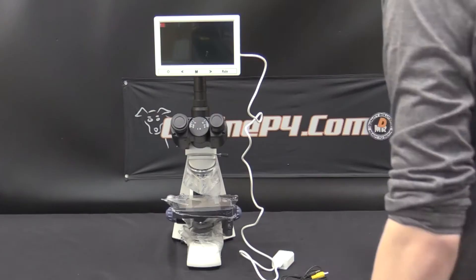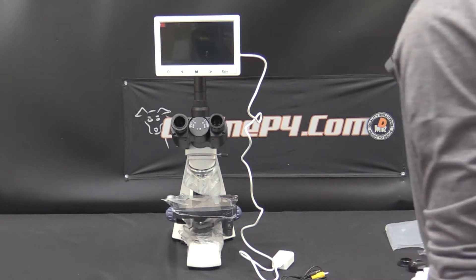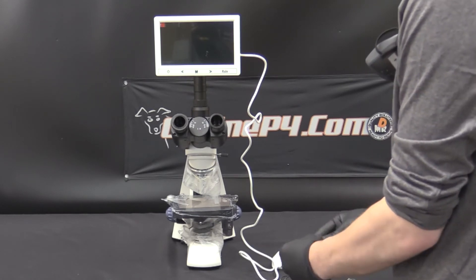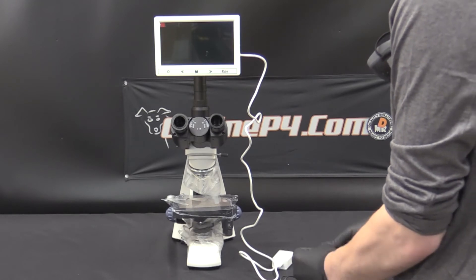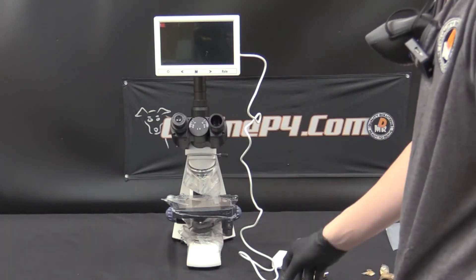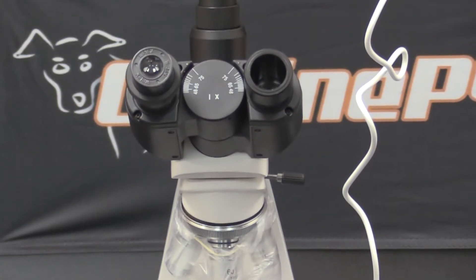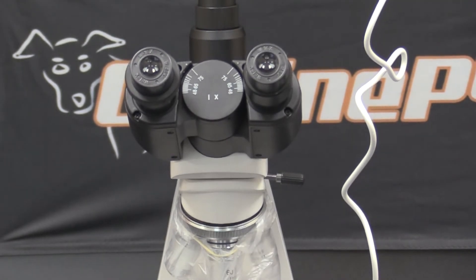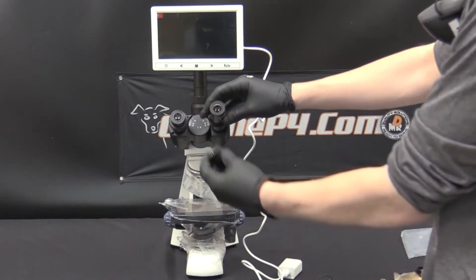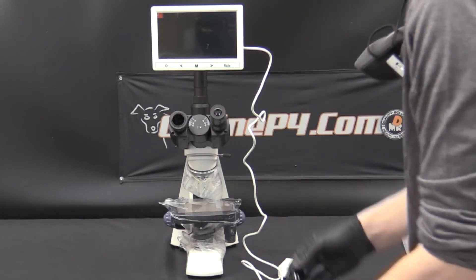The next step is to remove the caps for the ocular lens eyepieces. You will have to install the eyepieces and you have two different sets to choose from. The first set is a magnification of 16x — these just slide in and are ready to be viewed through. The other longer set is the 10x magnification, so using the smaller eyepiece actually gets you more magnification than the longer one. We will demo both of them in tandem.